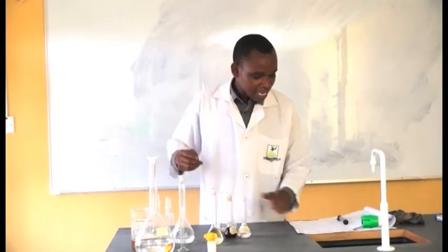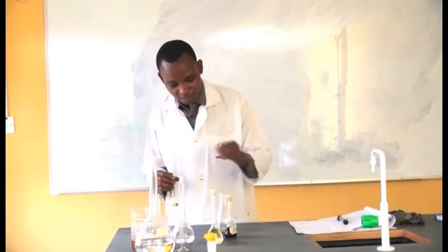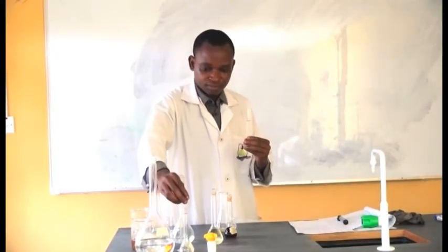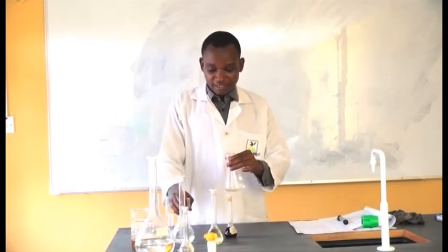The next step says add 10 ml of chloroform and shake. I'm going to add 10 ml of chloroform and shake now. This is our chloroform.